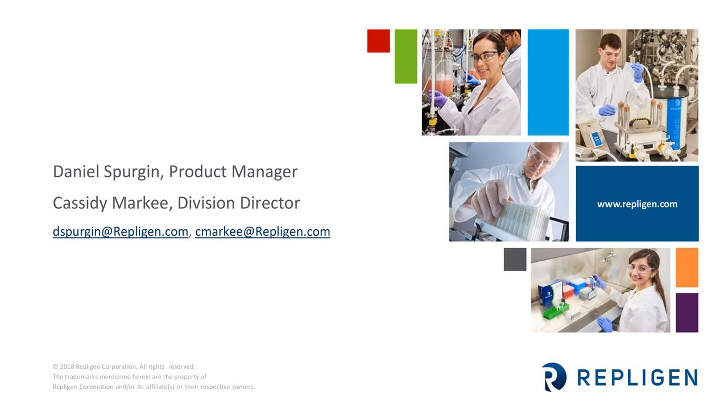So things like, what was your sample volume starting? What is the concentration? What is the total mass of impurities that you need to remove? Also the molecular weight cutoff, the buffers that you're using. So all these things play into how long it'll take and how much you can anticipate removing over a specific time. So it's always best to start with a longer period of time and then optimize working backwards. And we're here to help you do that.